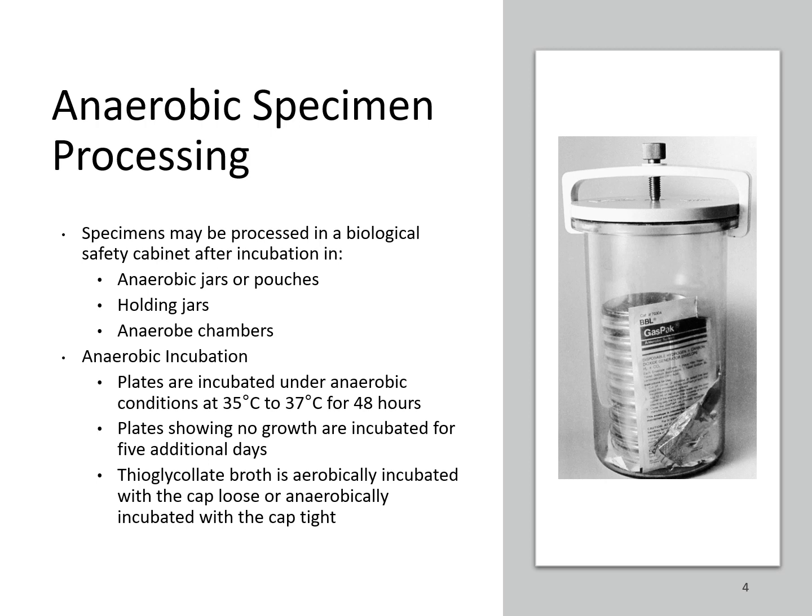Specimens are processed in a biological safety cabinet, and then these organisms are incubated in special conditions. It could be something like an anaerobic jar, or some sort of holding jar, which you can see over here to the right, where a gas pack has been placed in there to remove the oxygen, and then it's sealed shut.